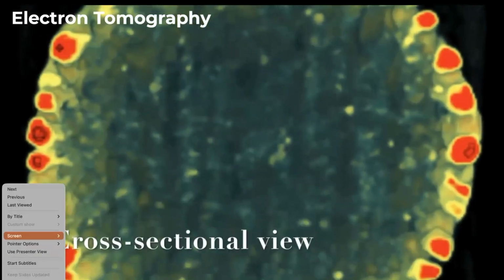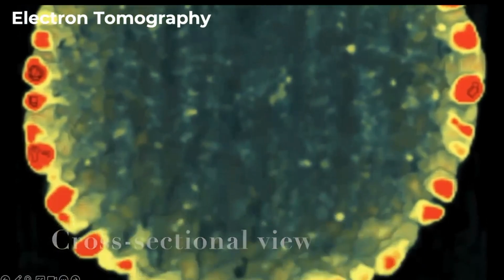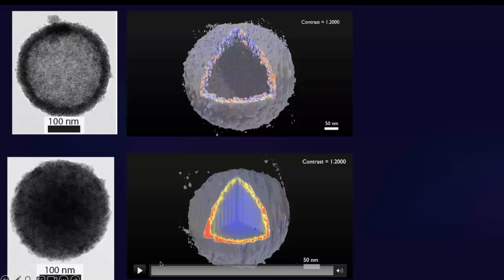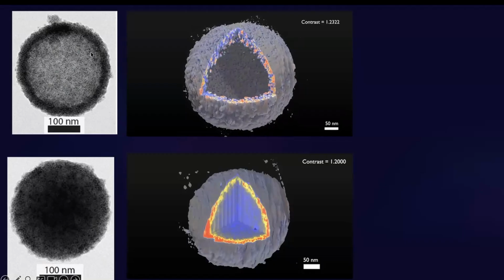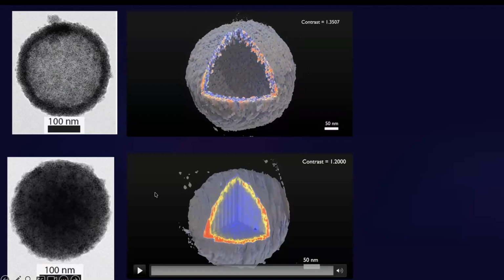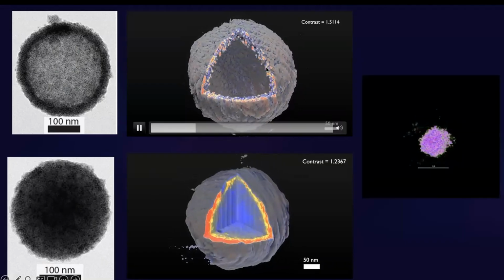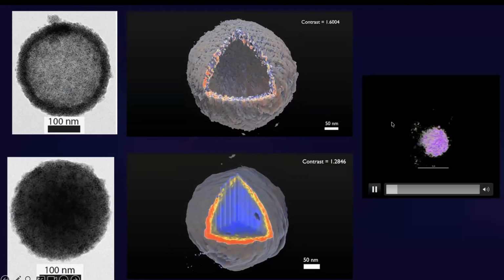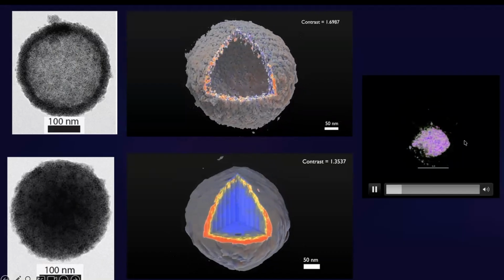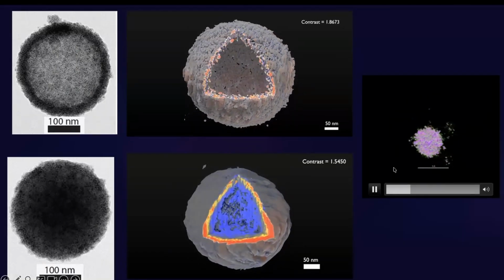We can locate every building block, and we can look at the coordinates of this. We can extract the three-dimensional coordinates and construct new structures computationally. And we can distinguish internal morphology, as I've shown you here, in two different structures. We can also collect similar-looking particles and use sub-volume tomography to see how an individual particle looks.